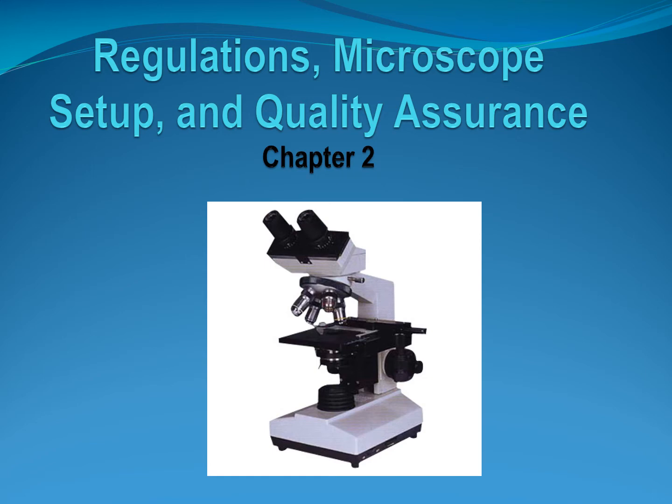Now in lab, we will have a microscope test where you will identify the parts of the microscope, and we'll do this in lab. You'll go through getting your microscope set up so that a physician or a lab tech can come in and it's all set up and ready to go. They look down on the scope and can look at whatever it is that you've set up for them. So I will teach you that in lab, and then you will have a test on not just the parts, but how to get something set up on the scope for a physician or a lab tech. So without further ado, let's get started on this chapter.